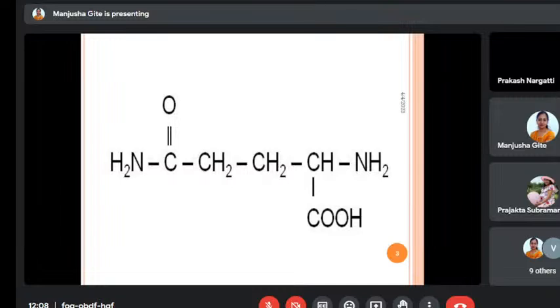If suppose the given compound contains oxygen or nitrogen, what is the mass of oxygen? 16. 16 means how many carbon atoms and how many hydrogens? So CH3, 1 carbon, 3 hydrogen. No, four hydrogens. Correct. Means now, in the simple example I have taken of dimethyl ether, this molecular formula is C2H6O.